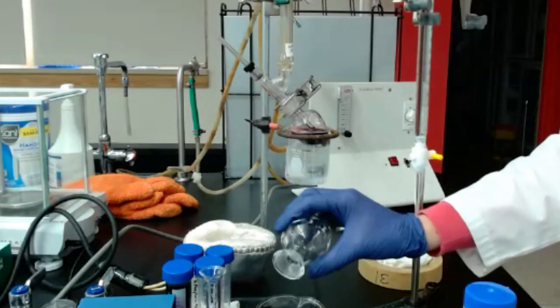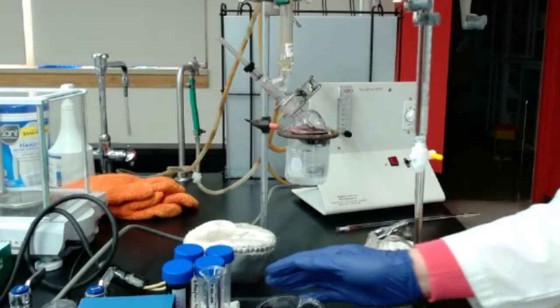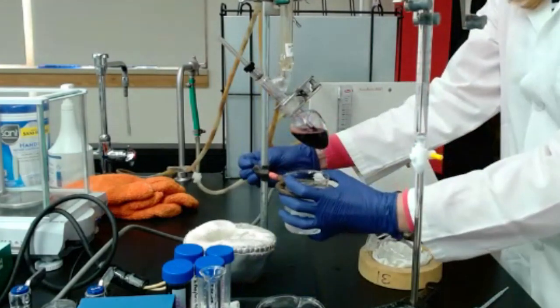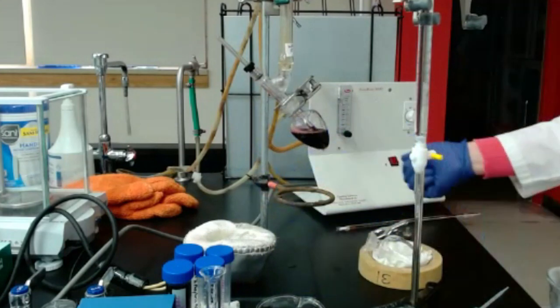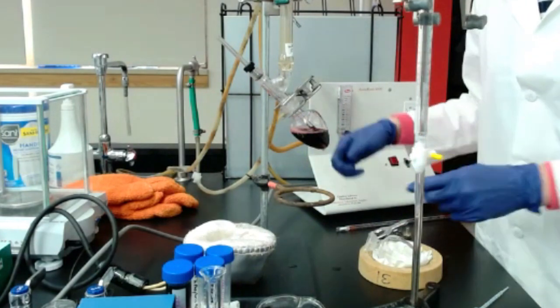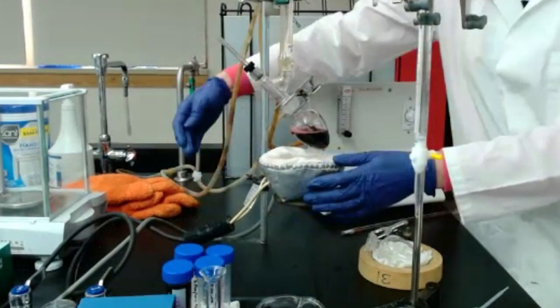So clean, make sure you have a trash, like a beaker, that is the trash. At the same time, I'm just starting the heat and I'm removing that glass beaker because I don't want to have everything exploding, because heat and cold don't like each other too much. I also have on the side that system, which is a heating system.